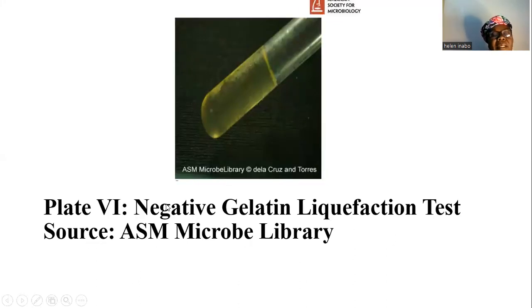Here is plate 6 showing the negative gelatin liquefaction test. The test organism was not able to elaborate the enzyme gelatinase, and so following incubation and refrigeration, the gelatin is still intact and is not liquefied.